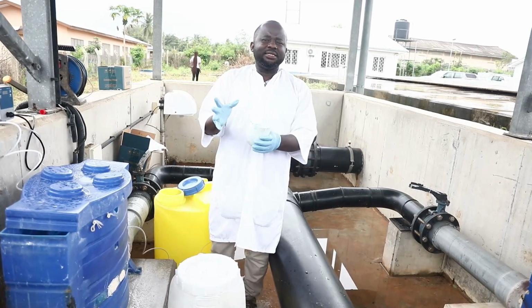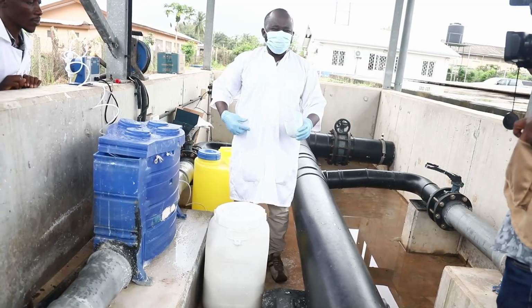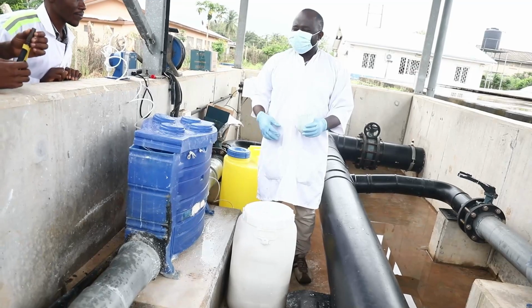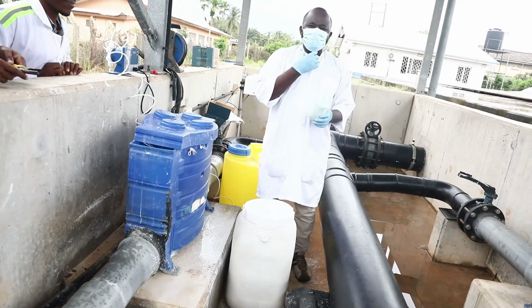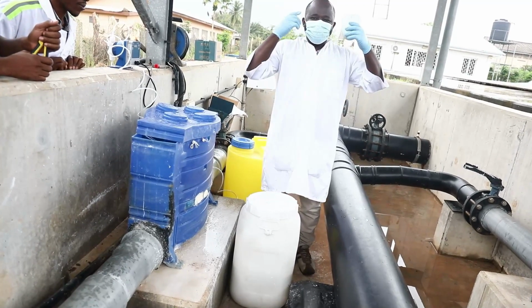Chlorine is very volatile, and it's a very high oxidizing agent. So please, when you are dealing with it, you need to be in the proper PPEs. You need to be in your coat, because you can stain your dress. Your hands need to be protected. For the fumes that come when you open it, you need to wear a nose mask and goggles as well.